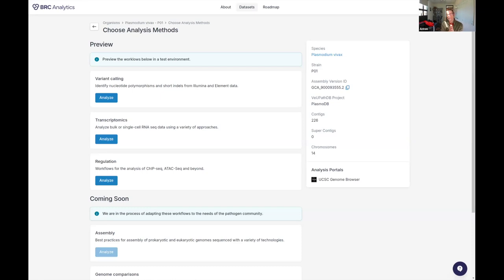It's the same essential approach which you would use, for example, for bacteria or for viral mixtures. The only difference here is that when you're calling variants in bacteria or in viruses, you're usually dealing with a single sequence as a genome in most cases. You know, COVID is a single sequence. Salmonella genome is a single sequence. In case of Plasmodium, of course, you have multiple chromosomes. So you have multiple sequences.